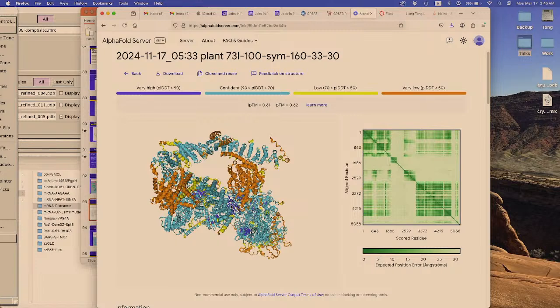You can see there's some contact in this protein and that protein because off diagonal is the interaction. And then within this protein, a lot of interaction. But then this part, there's really not much interaction. So this plot also tells you whether there's anything important going on. For example, there's a stripe right here that's interacting. So you have to look at not only this model, also look at this together. All the information together will give you a sense how believable your prediction is.